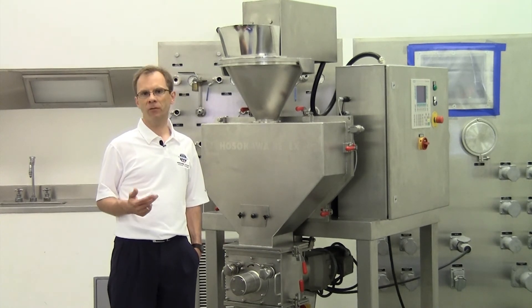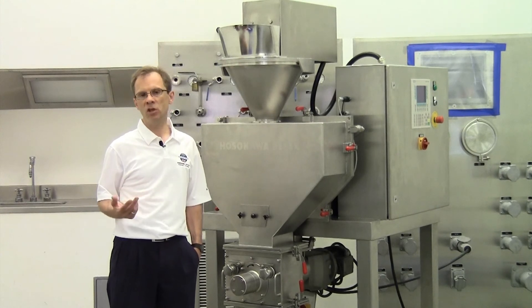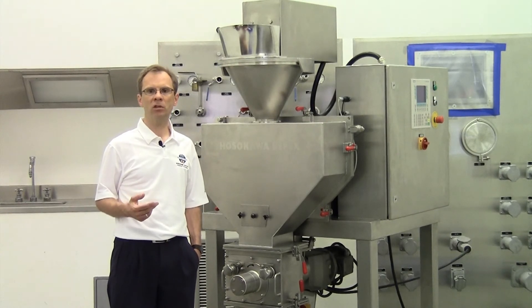The biggest advantage of compaction is that no further binders are required. It is very often possible to work with the pure ingredients. The energy consumption of this granulation type is very low compared to wet granulation.